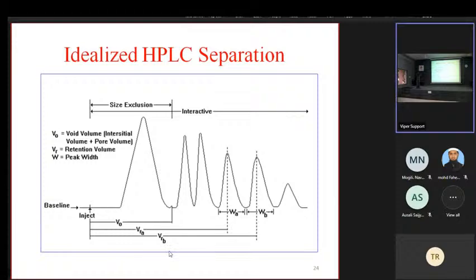The mechanism is similar, but the only difference is the column. We can use the same machine for protein separation or protein analysis, but we require a different column. We have C18 and C8 columns, so experiments related to C18 and C8 we can perform. If you want to know what kind of protein it is, then you have to select suitable columns.